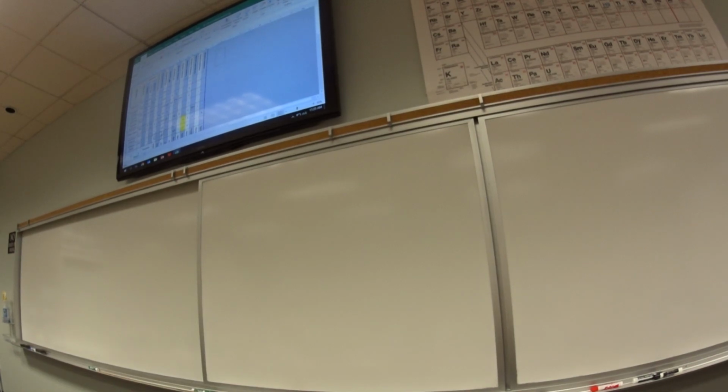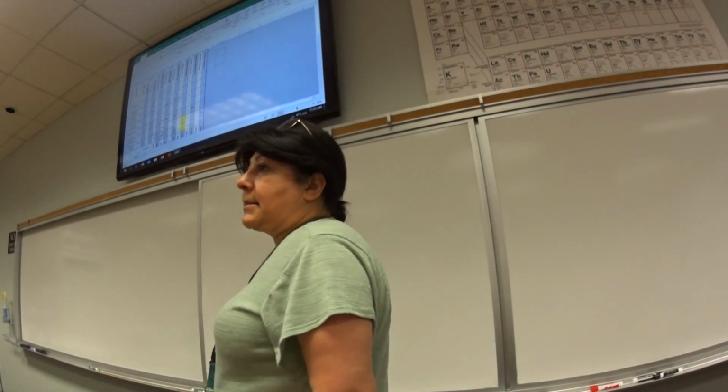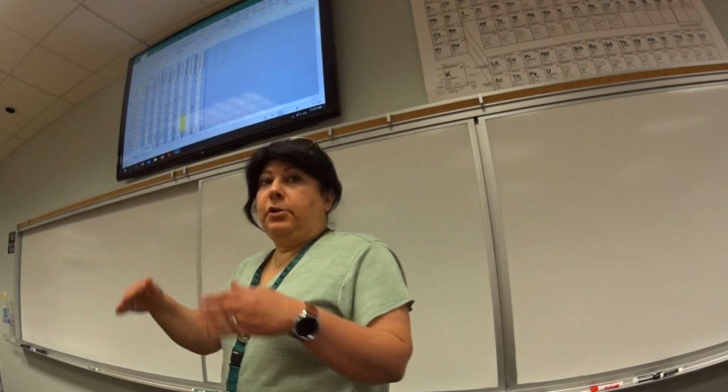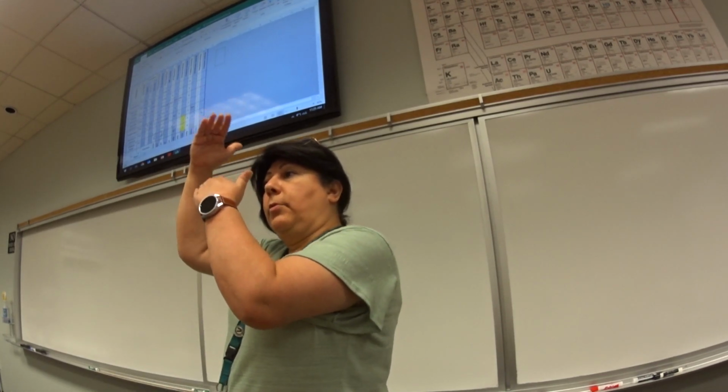Now, when you look at it, oxidase is pretty fast too. Look at these two. The oxidase for 2 of them is positive. So right away, if you do oxidase and your oxidase comes out positive, you know you're one of these 2. Is your oxidase negative? You're one of the ones above.